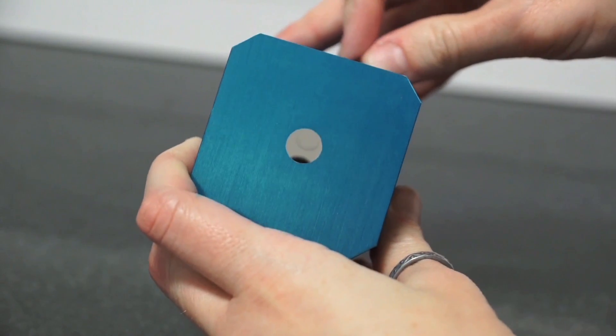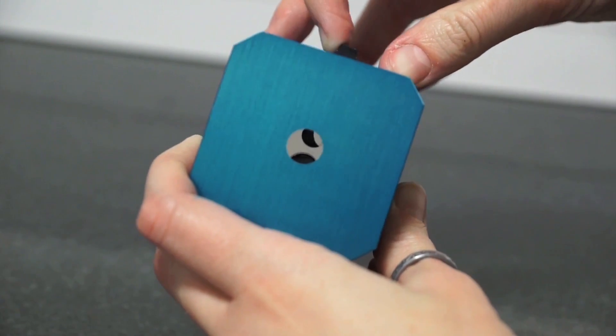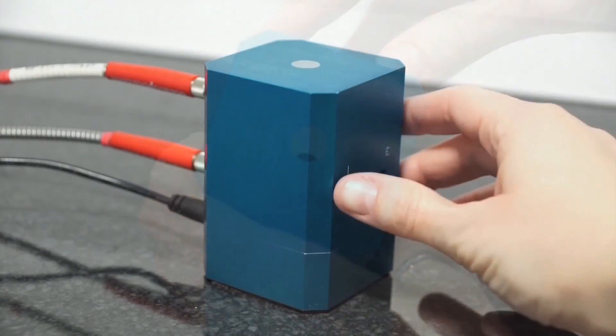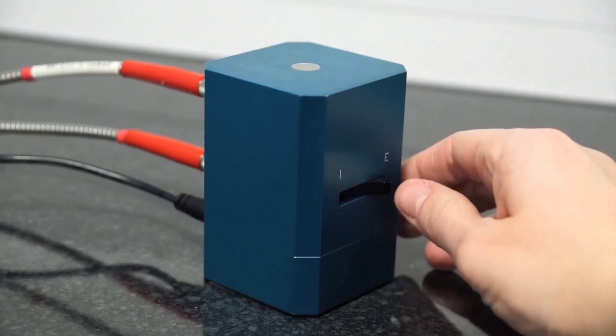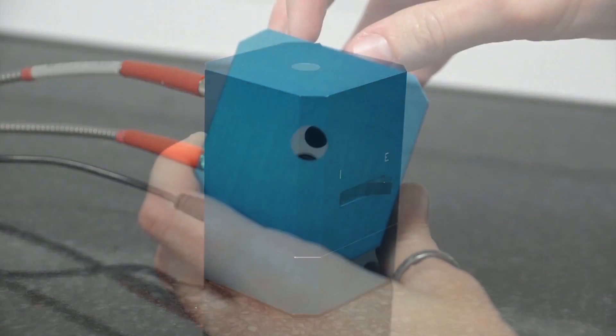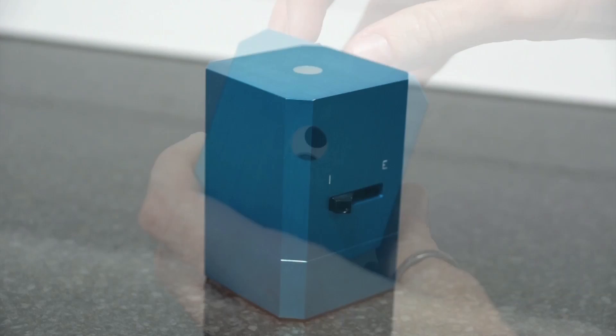The ISP Ref is fitted with a gloss trap for trapping specular reflection. When open, it creates a gap in the sphere's surface positioned at 8 degrees, the same angle as the S port. This means that all specular reflection from your sample is lost, and you will measure only diffused reflection.